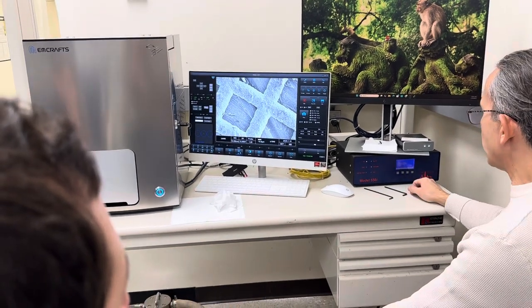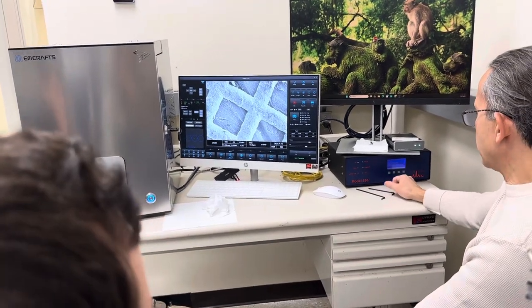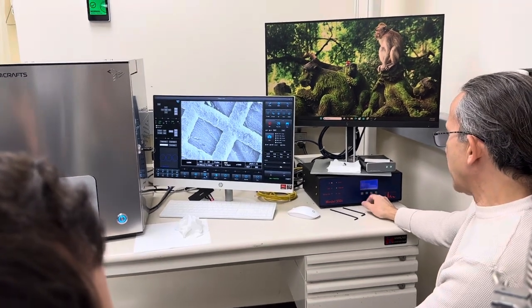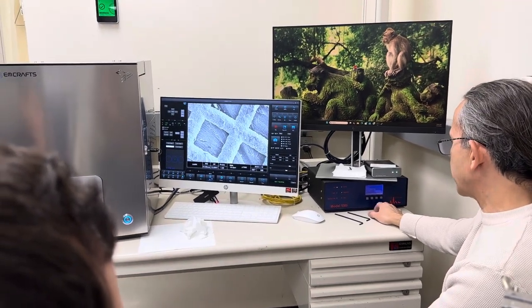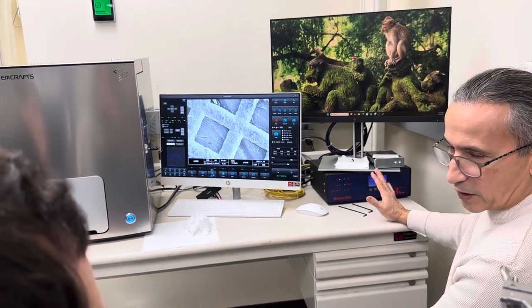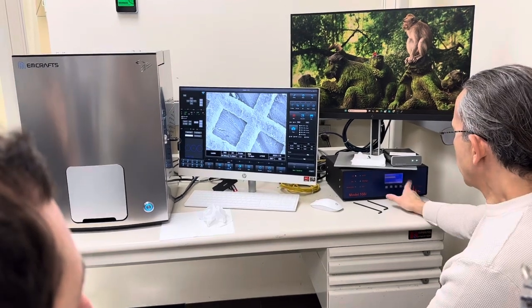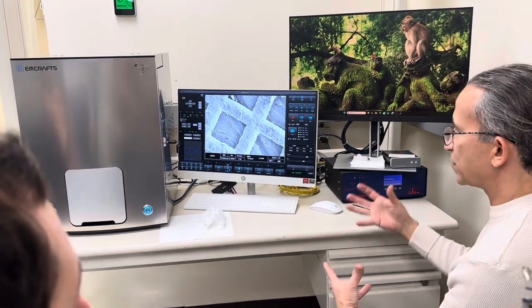If I select my menu on this, I could look at LCD contrast, for instance, and do some adjustments there. I could scooch down to oscilloscope, enter that and go to setup. Just for now, we always leave it on this screen. Later on, we'll talk about that stuff, but I just want to get you guys walking on this realistically. So this is important, counts per second. So we know we're seeing information.